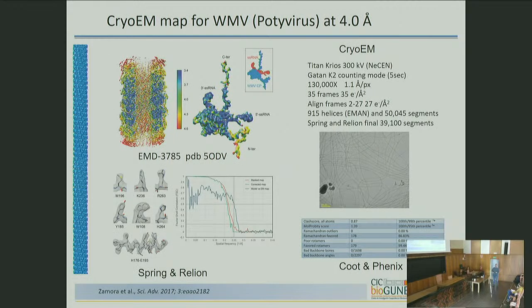In this case, we use different software, for instance, but more or less the results are very similar. Different microscope also, but we end up in similar resolution. Not a large number of asymmetric subunits at the end, but enough to put the protein in register and to describe, in this case, a Potyvirus.